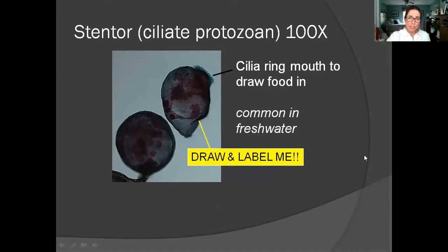This is another ciliate protozoan — this is a stentor. Stentors come in lots of different shapes, but one thing they have in common is a ring of cilia around their mouth to draw food in. This is just one single cell big — these are unicellular organisms, as are the paramecia. They're really common in freshwater.